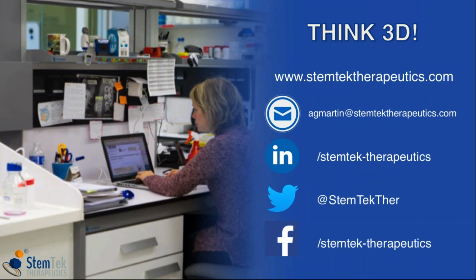Okay, another one is what percentage of FBS do you use, if you can tell this? Yes, of course I can. So this is a defined medium. It doesn't have any FBS. That's part of the reason why the spheroid system works, that the cells do not differentiate. There are basically the tumor-initiating cells that make the spheroids and their progeny. It's very relevant not to have serum, because it immediately differentiates the cells and they stick to the bottom of the plate. So the answer is no serum.